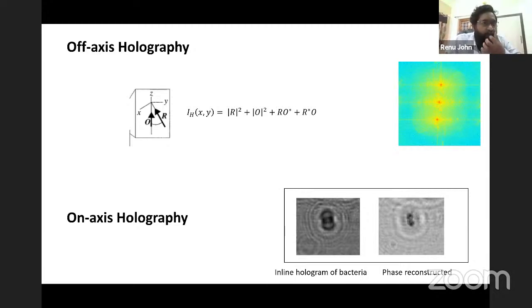So basically you save your sensor area at the cost of your computation. It won't be a single shot reconstruction. You would have an algorithm working behind, but with GPU architectures, we can almost have real time or live reconstructions with the help of algorithms.